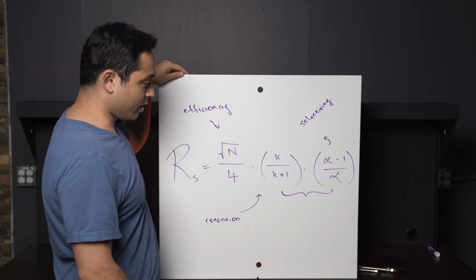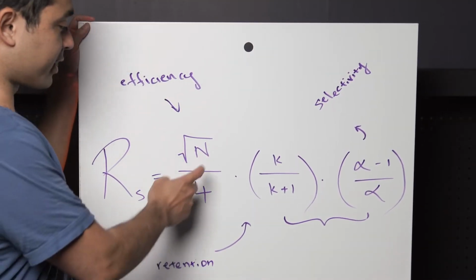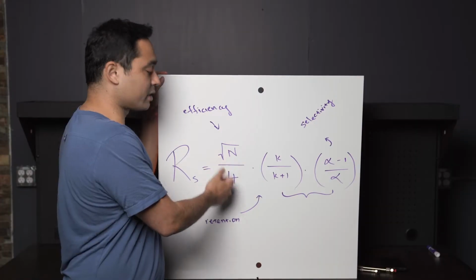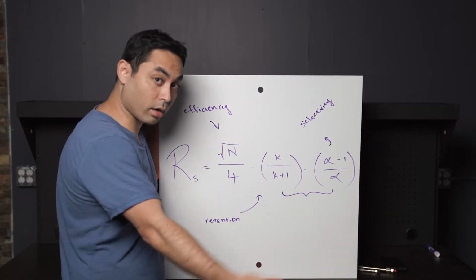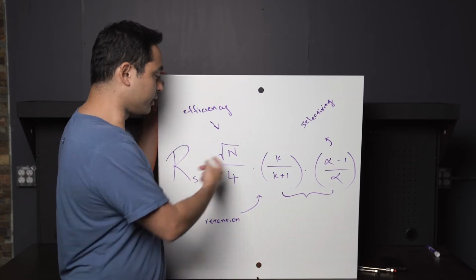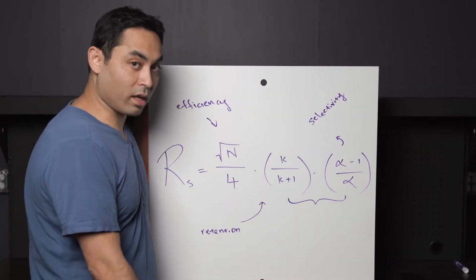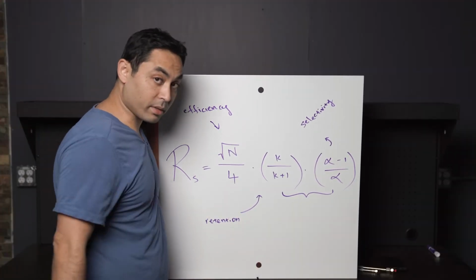In a nutshell, this is efficiency, like your theoretical plate counts. The smaller the particles you get, this value goes up. Or the more particles you have in your column, like a longer column, this goes up too. If you double the column length, you double the efficiency. If you halve the particle size, like from 5 micron to 2.5 micron, you double the efficiency.